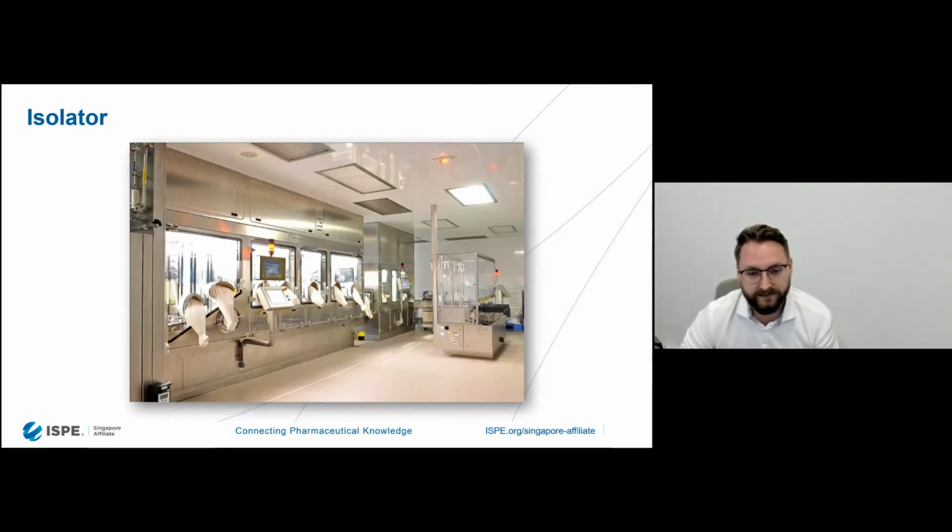Much easier to maintain. But the main reason isolators are desirable is the increased separation of the process from the operator. So they're very similar to RABS, and generally there is a barrier, and it will have a glove port. But unlike a RABS, if for some reason you cannot correct the issue by using the glove port, you cannot open an isolator up.